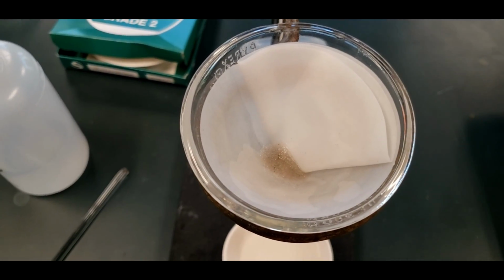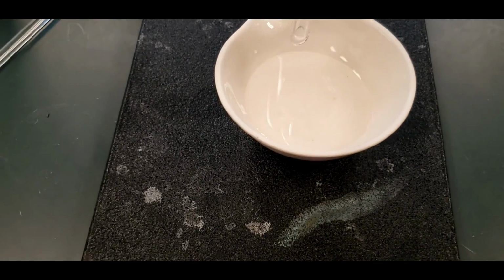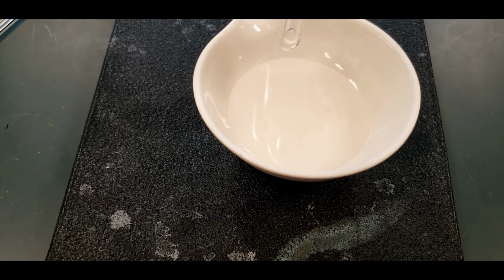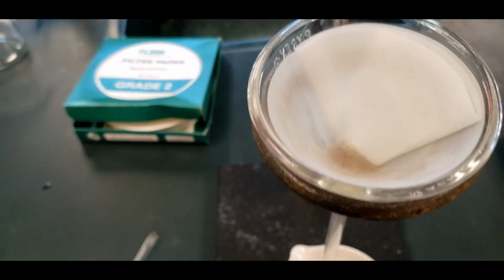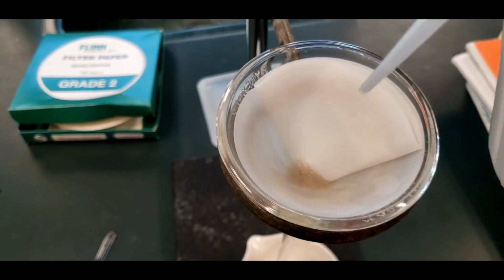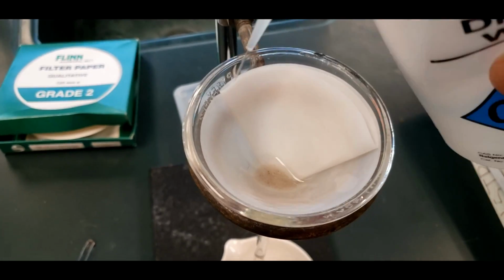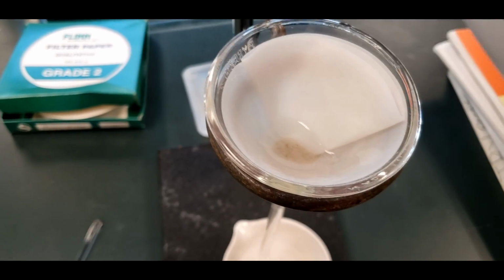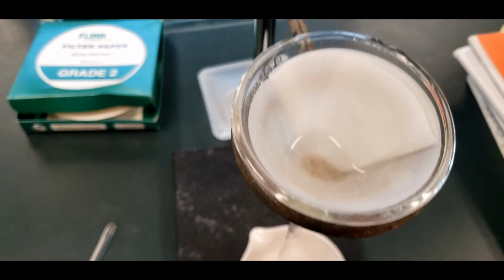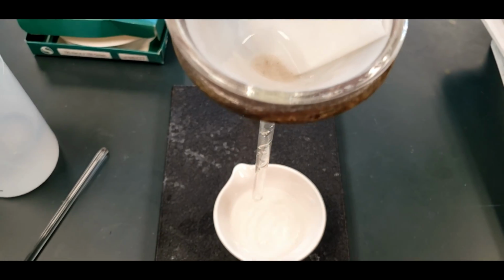So here's the filter paper after about 5 minutes. There's our salt water, that's our salt solution. And then this is some moist sand. What I'm going to do, while I'm holding the camera here, is wash through the filter paper and the sand, and that should get rid of any extra salt that was left behind. See, it's going through again.